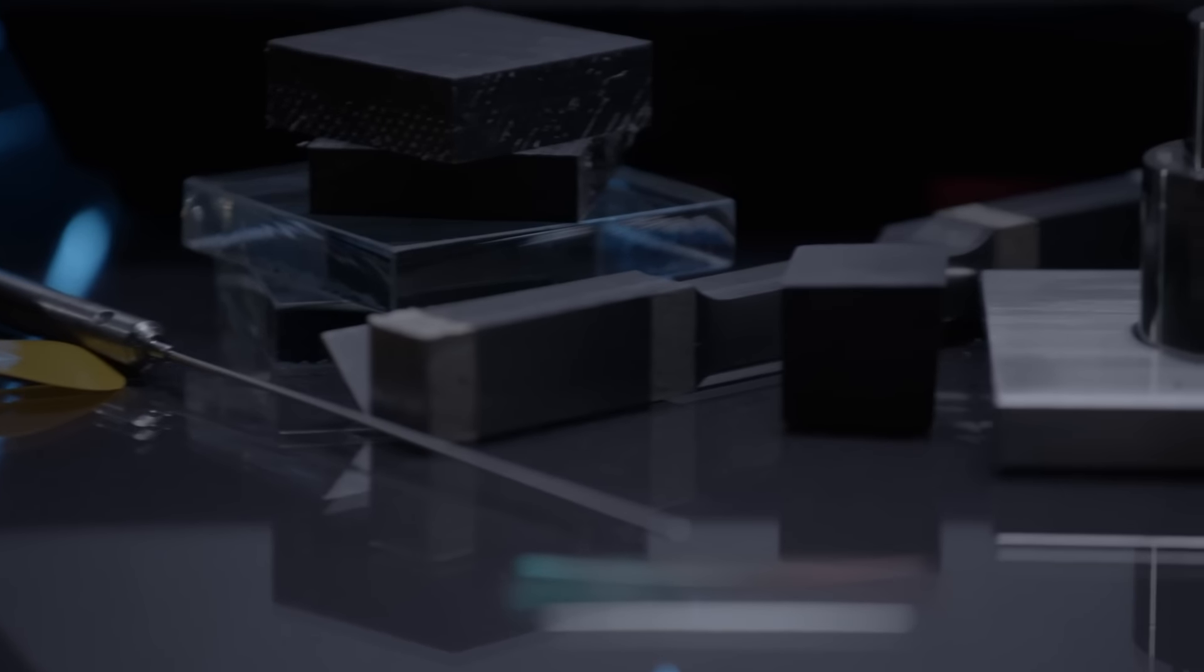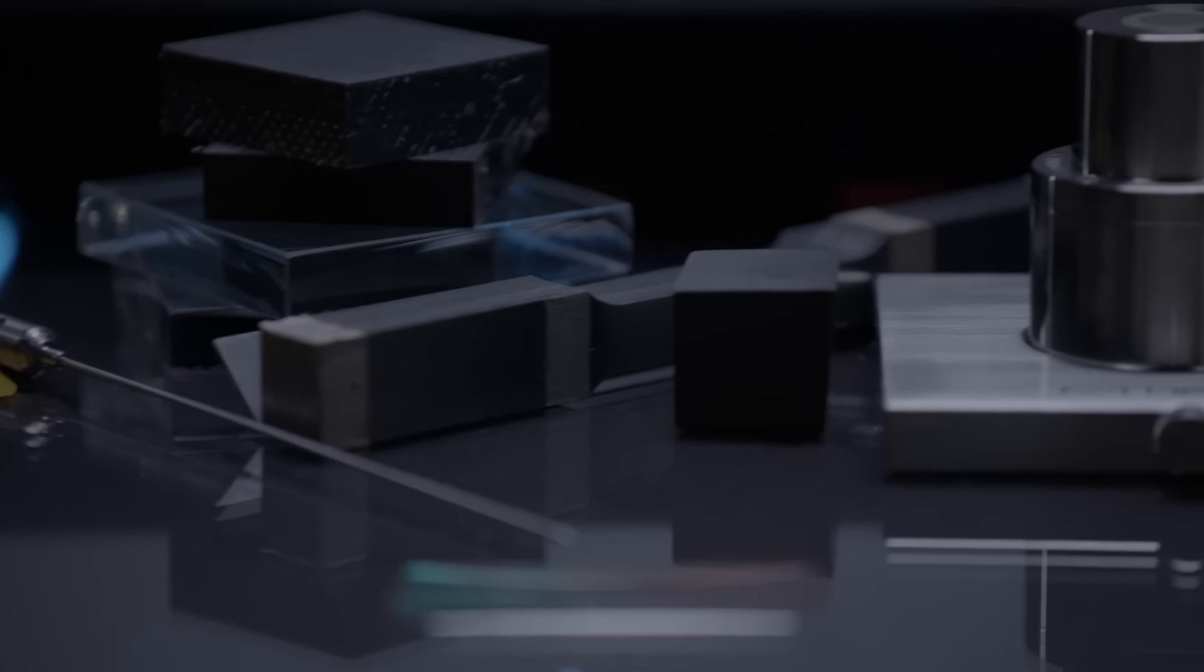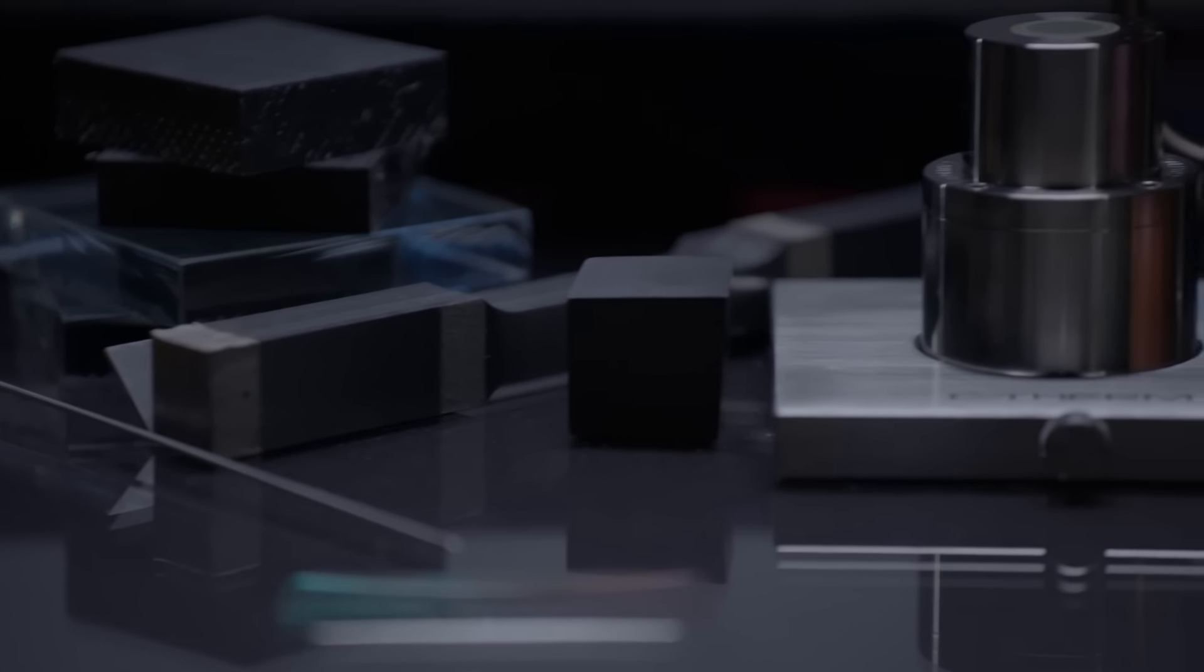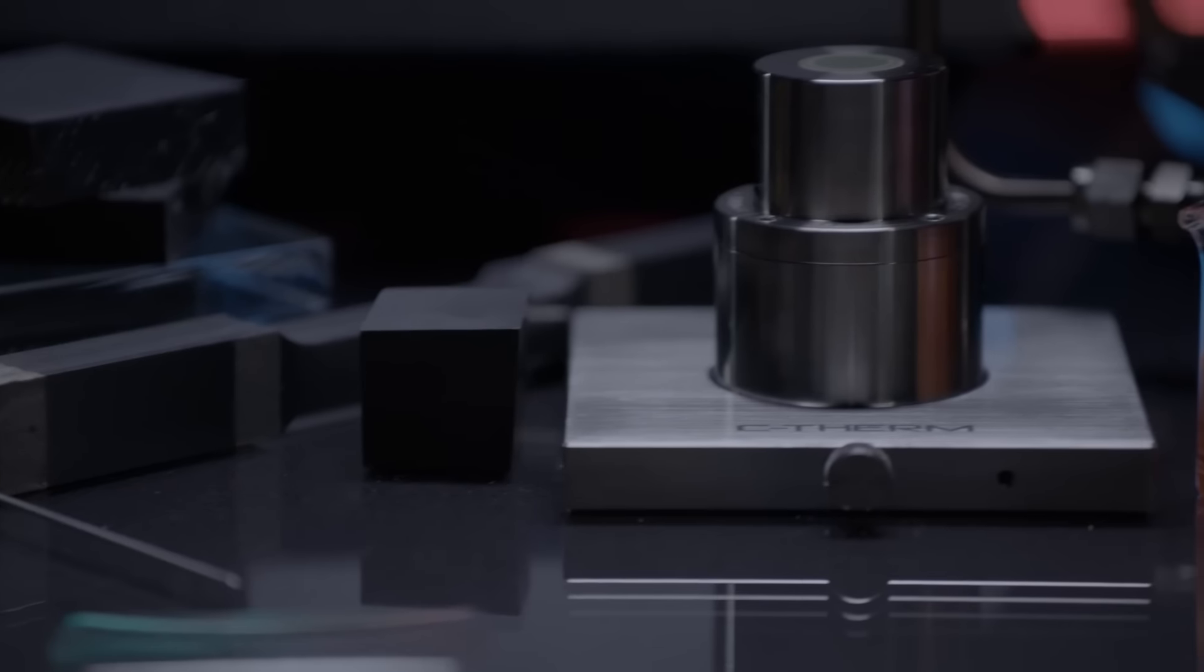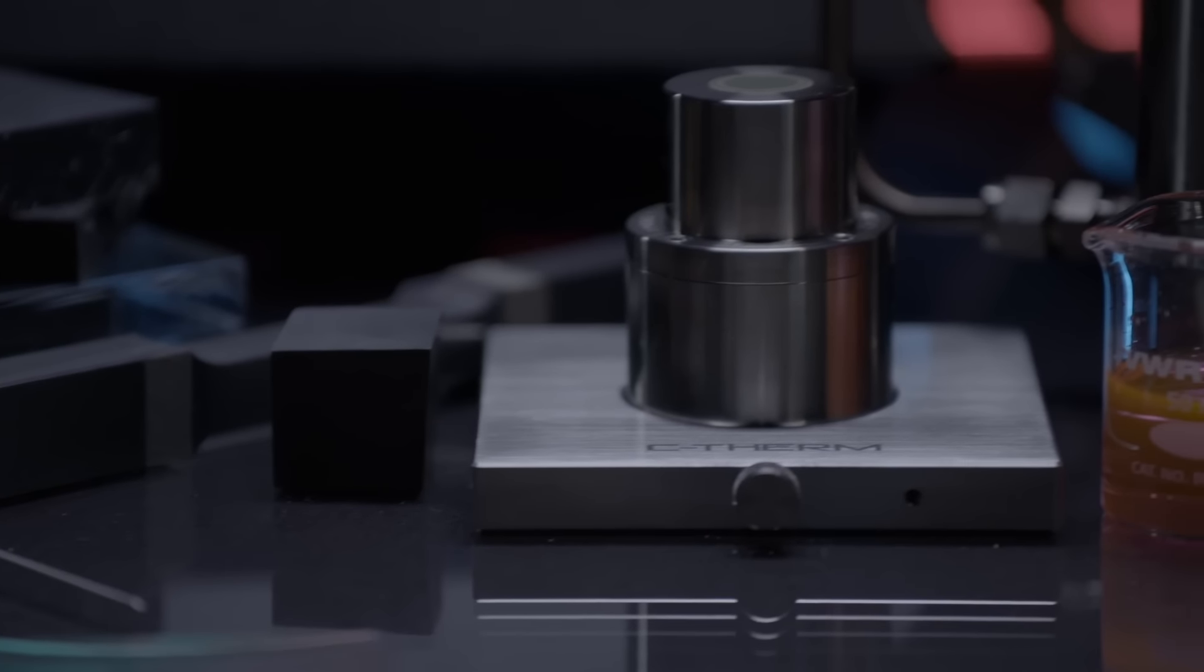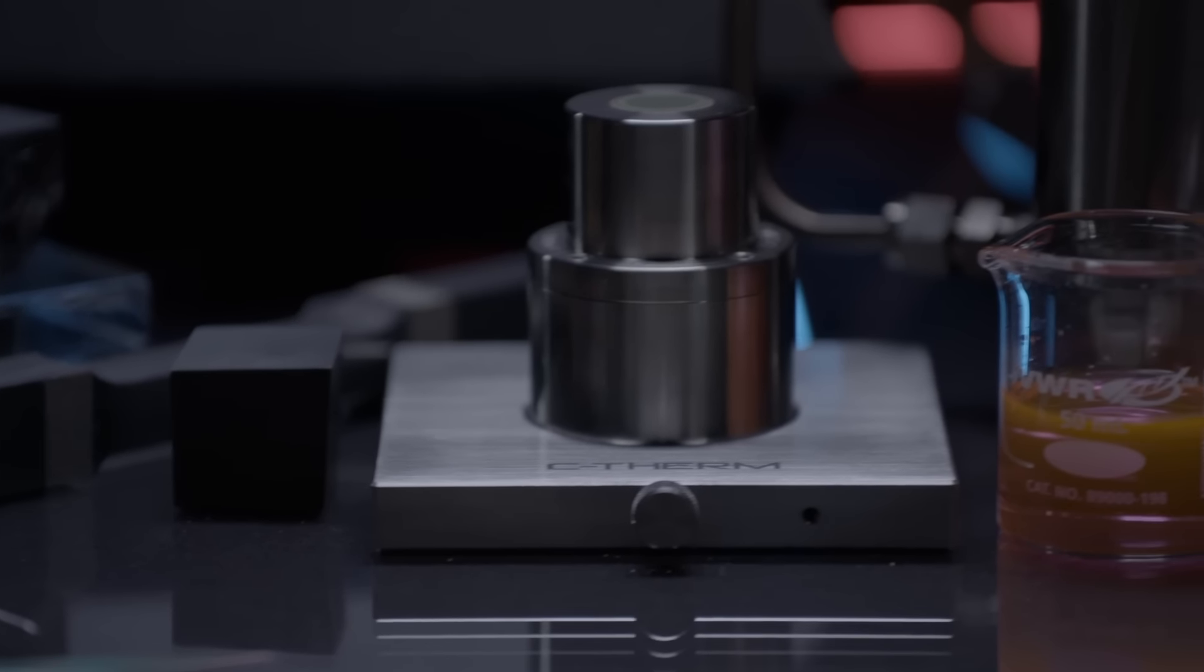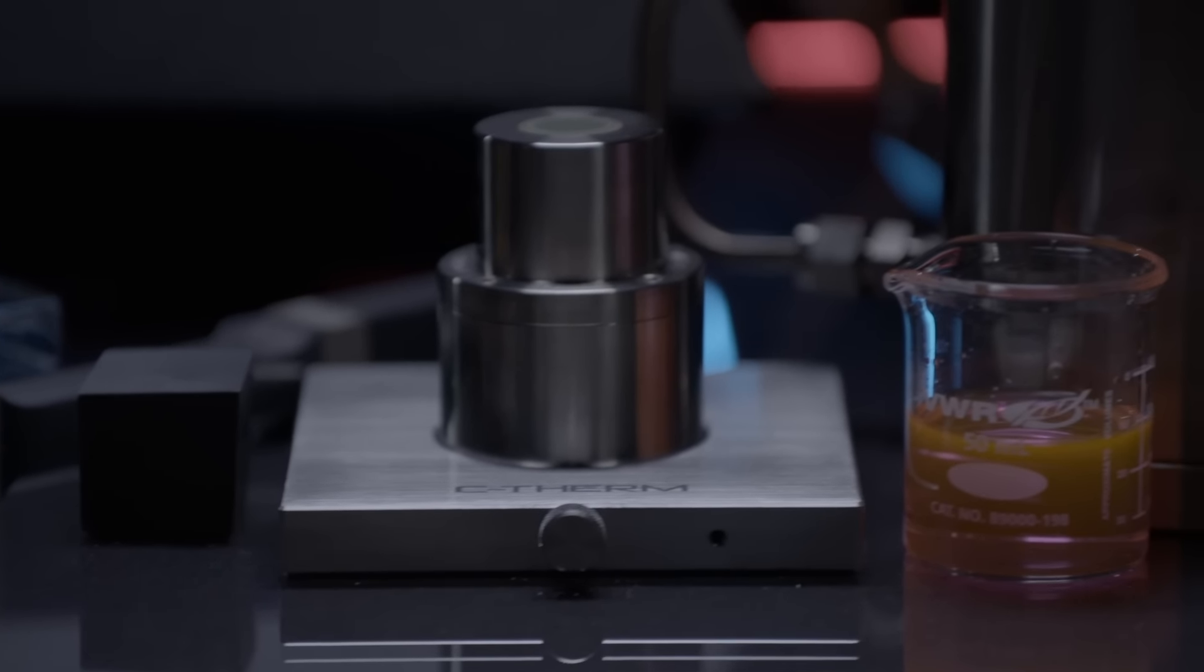Trident reflects C-Therm's years of experience working exclusively to provide labs, researchers and manufacturers with the very best in thermal conductivity measurement.